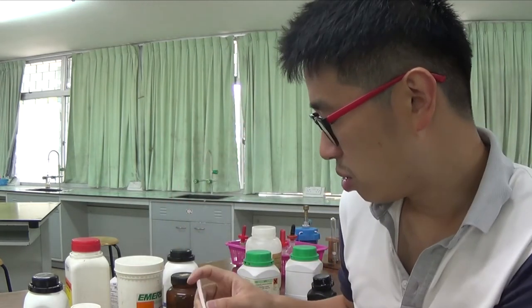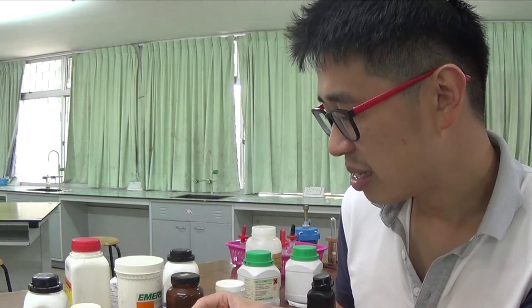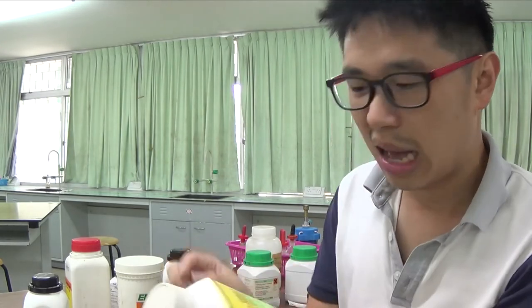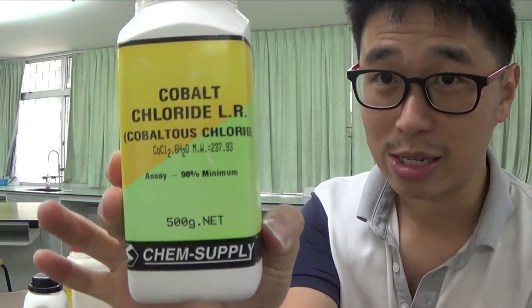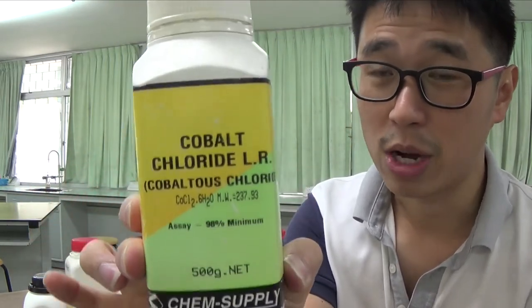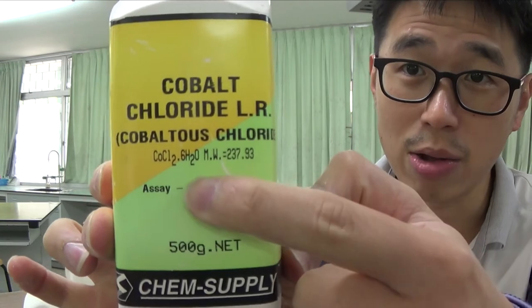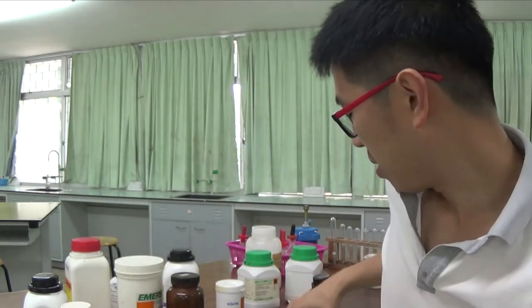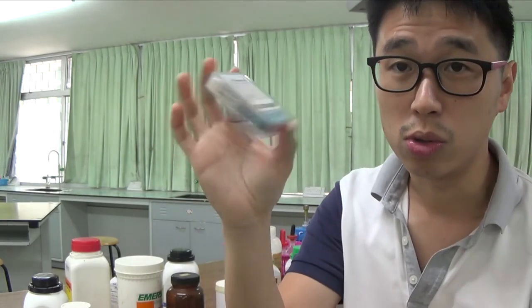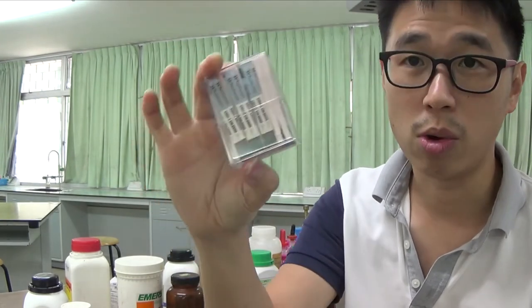Okay. What I'll do instead is show you by heating this later. I remove all the water of crystallization and then it will become blue. Because once I remove all the water, I only have the anhydrous thing there, that will become blue, and that is actually what is used to test for water vapor.